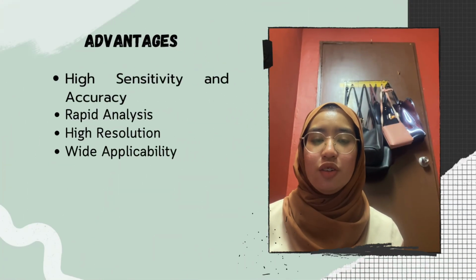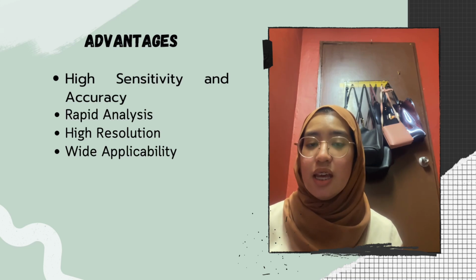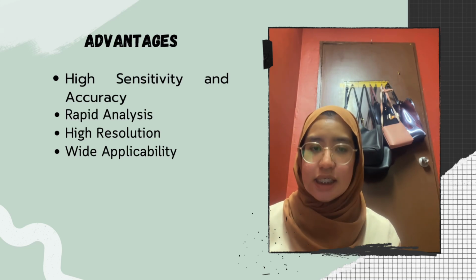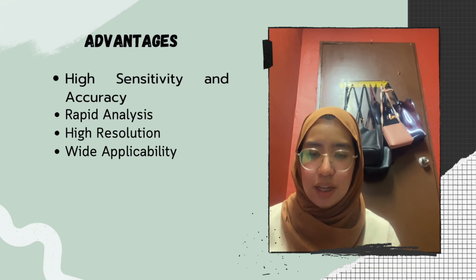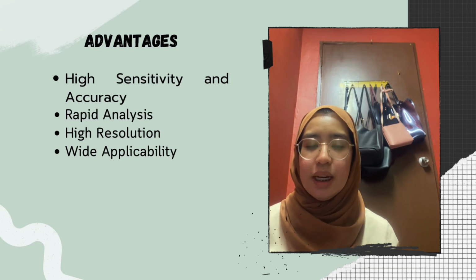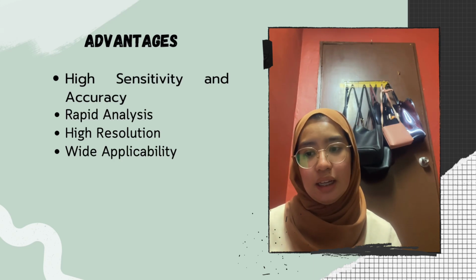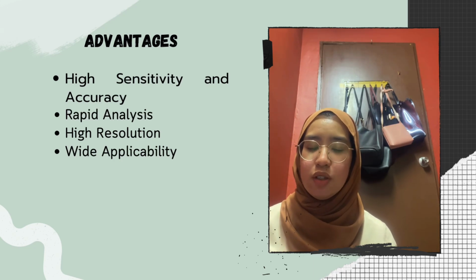Gas chromatography, or GC, has so many advantages. The first one, high sensitivity and high accuracy. GC can detect and quantify compounds at a very low concentration, making it ideal for trace analysis. The second one, rapid analysis. It provides fast results compared to other analytical techniques, especially when using optimized conditions.